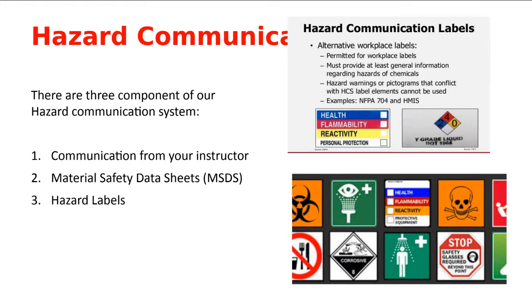So if someday I come in and say, today we're going to be working with cinnamon aldehyde, and it's not dangerous to you, it might be a little bit irritating if you get it on your skin or your eye, be sure that you wear your personal protective equipment, right? But you open it up and the smell bothers you, so your eyes start to water and you're like, I don't really believe that guy. You have the right to look that up right then and there, or go over to the area where our safety data sheets are and look up that reagent to see what the potential hazards are. Okay? And then the hazard labels.